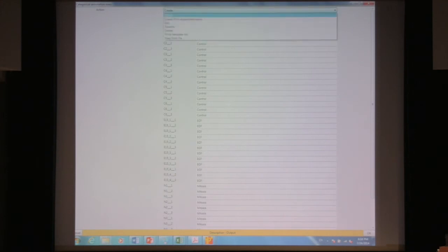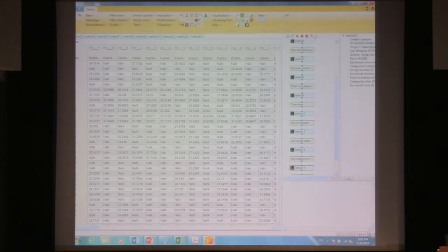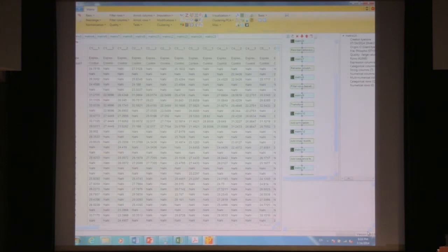So in this case, we didn't have too many experimental groups, but that already became quite tedious. So just as yesterday, you can use a template file, or you can create from experimental name using regex in case you want to do it in a more efficient way. So if we go ahead and create those groups, what you'll now see in the matrix, I'm not going to continue, you'll see the groups along the top here now.